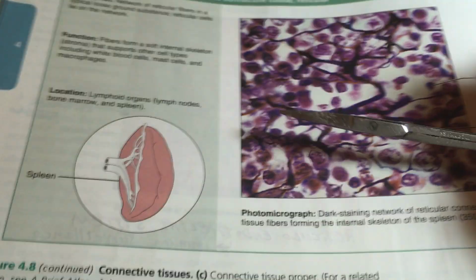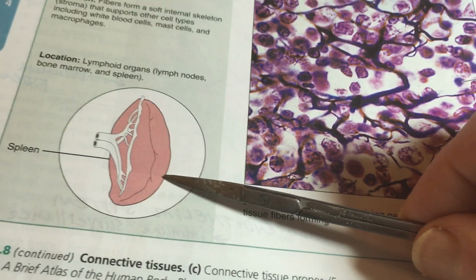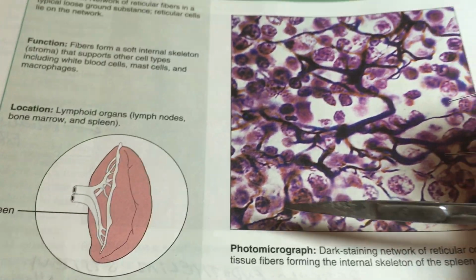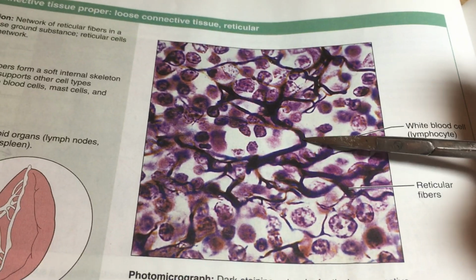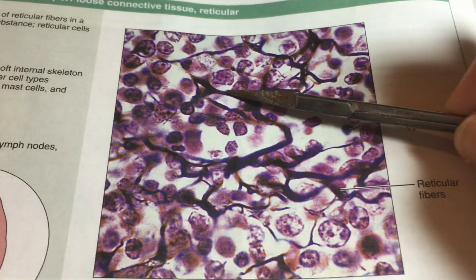Okay, so we do have connective tissues that surround certain organs. The testis is one. Over here we have the spleen. It turns out the kidney, again, is an organ in which all of these organs are enclosed by some fairly substantial reticular fibers.